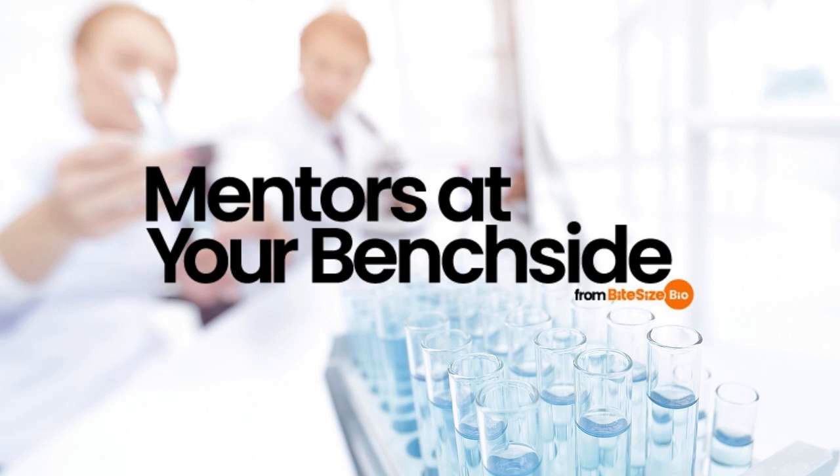To be more accurate, using different combinations of these chemicals, you can cleave a DNA sequence wherever there's a cytosine, wherever there's a cytosine or a thymine, wherever there's a guanine, or wherever there's a guanine or an adenine. So if you put your sample into these 4 different reaction tubes, you obtain different fragments depending on the combination of chemicals. Number 3. Electrophoresis and autoradiography.